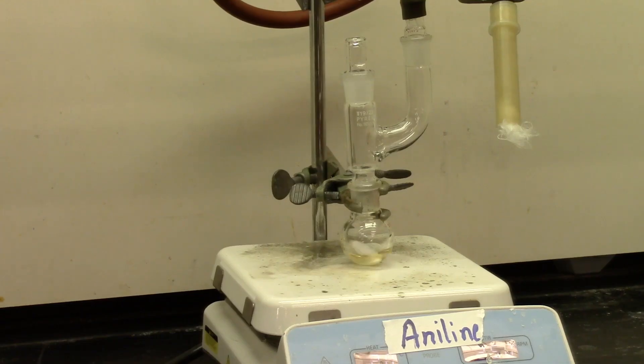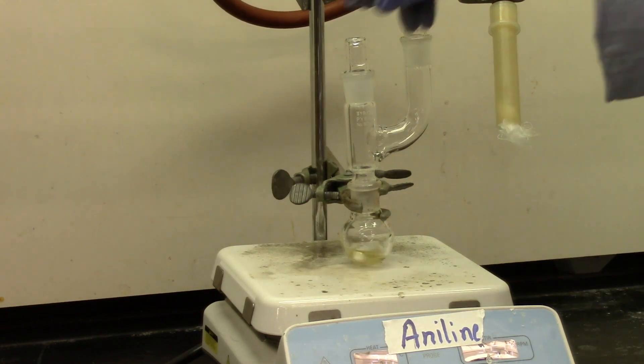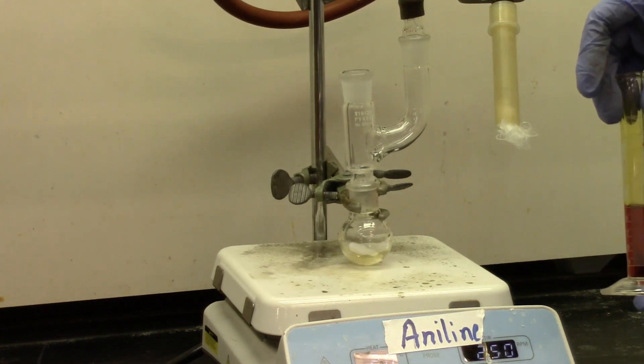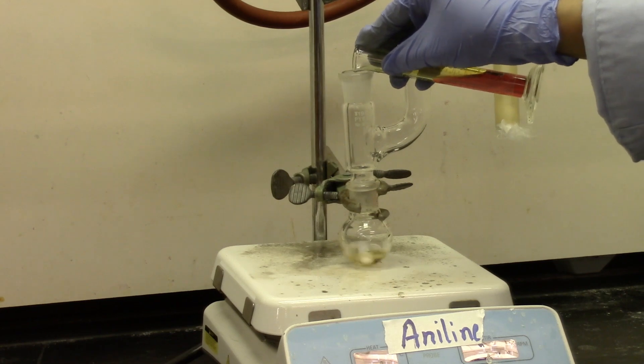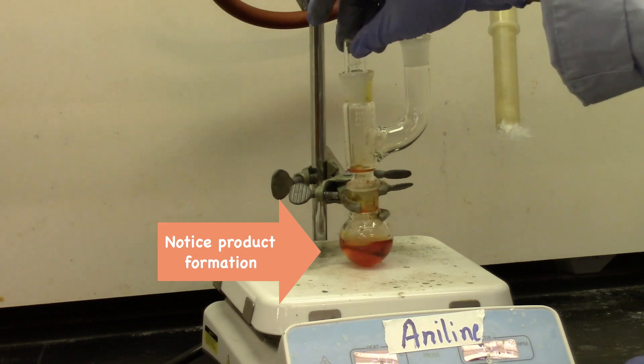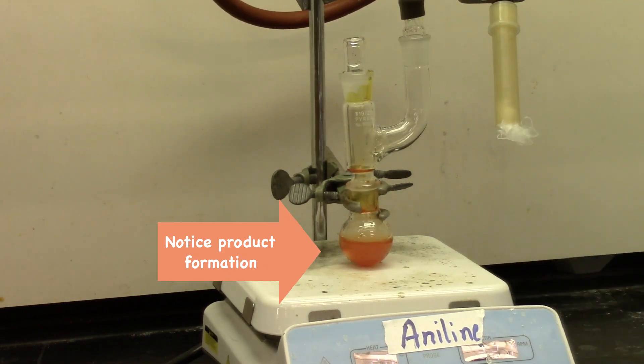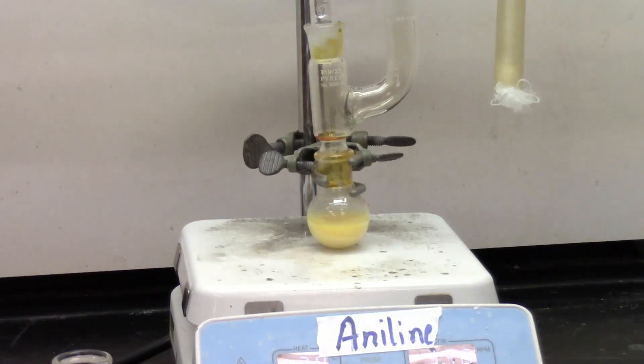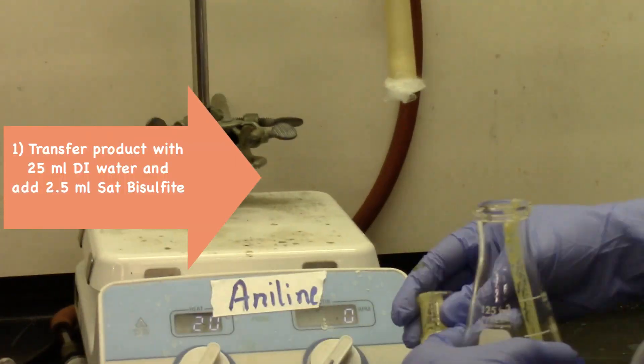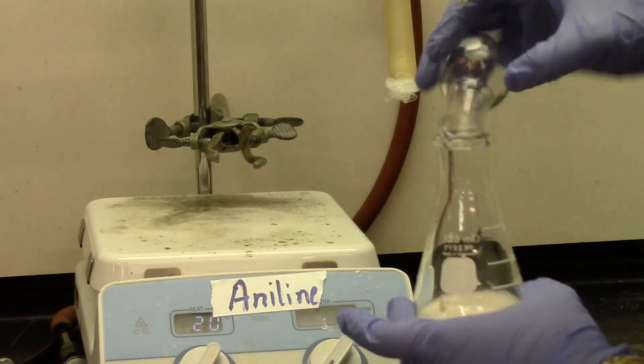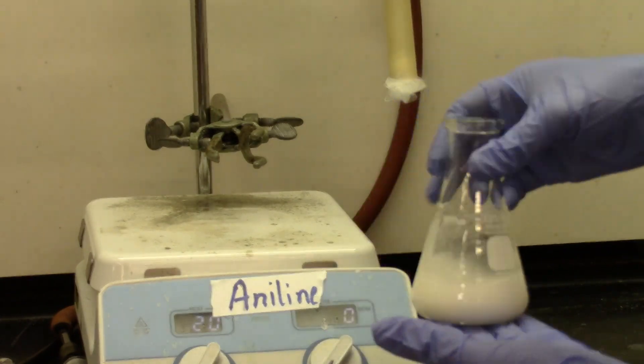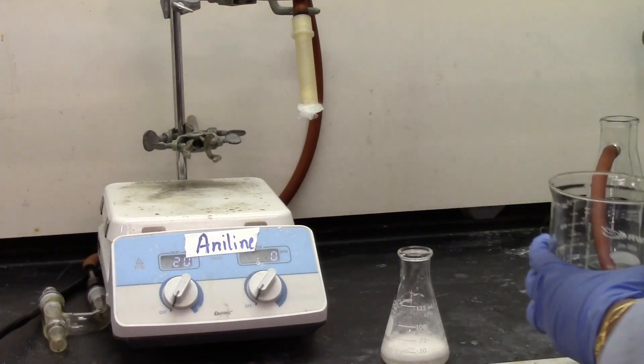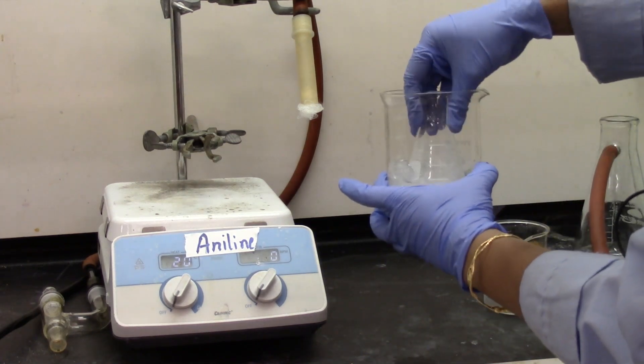So this is the aniline reaction. The aniline stirring with the acetic acid. Now I'm going to add my HBr bromine mixture. This is 5 ml. I'm going to pour it down the Claisen head. It's been about 20 minutes. I'm going to turn off the stirring and transfer this reaction mixture. This is aniline, as you can see it's labeled. I'm going to transfer it to a 125 ml Erlenmeyer flask.